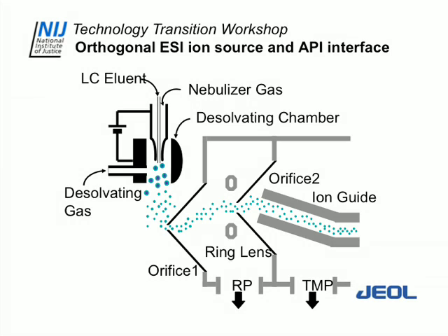So we took the atmospheric pressure interface apart and took a look in it, and the back of the orifice was as dark as this thing. It had stalactites and stalagmites dripping off the bottom. We realized we'd really contaminated the interface, but it had done its job, and it kept the inside of the atmospheric pressure interface clean. So behind this, there are a couple of ring lenses in there.